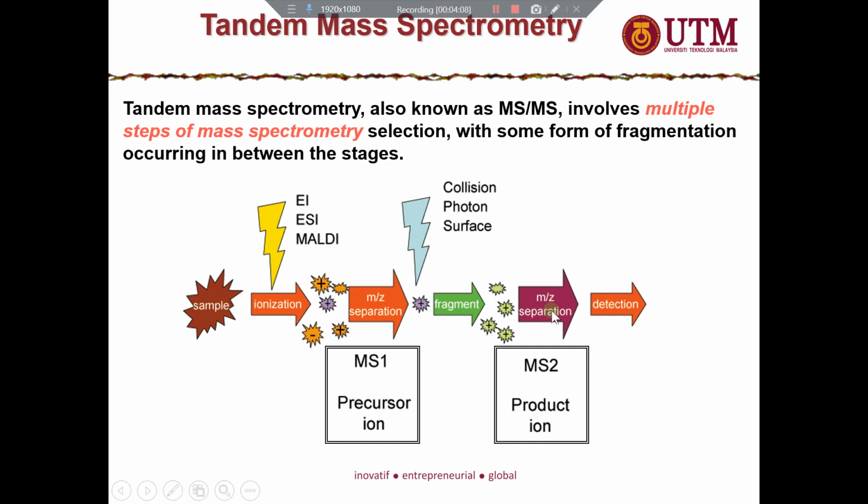From the large one, you look into the very small detail of your molecule. Alright, that's why we need mass spectrometry, tandem mass spectrometry. The best thing about tandem mass spectrometry is that you can remove almost all the background noise, and then you can go for trace level analysis. Okay, macam mana nak cakap, senang cerita. Okay, contohnya lah dekat sini, from the first ionization, you hit your molecule.